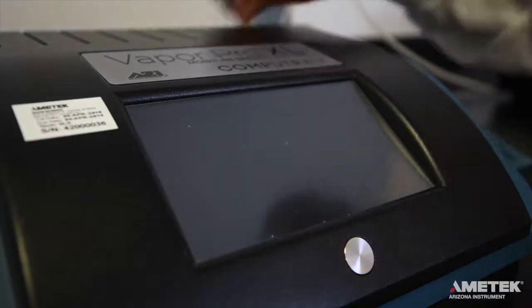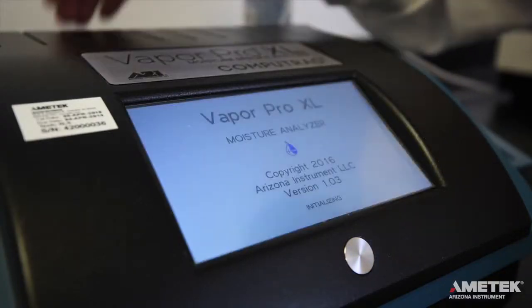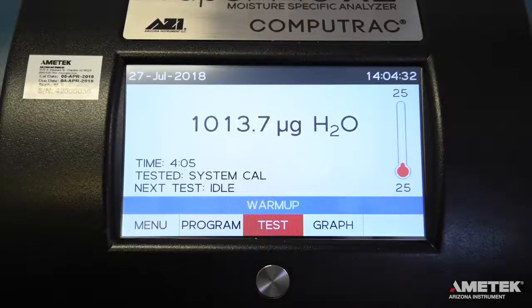When the instrument powers on, the screen will momentarily display the firmware revision number and the instrument's serial number. After the instrument boots up, the home screen will appear.